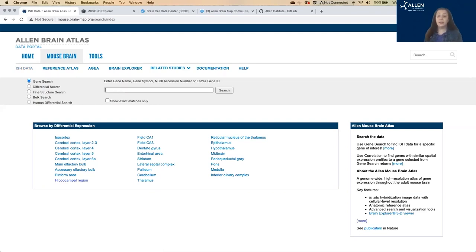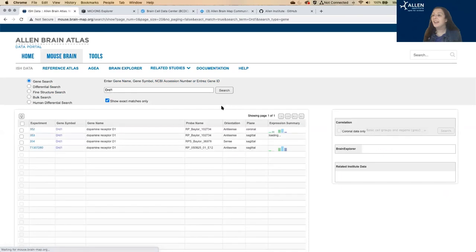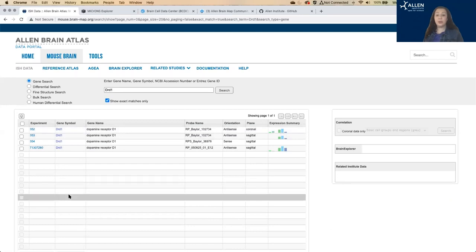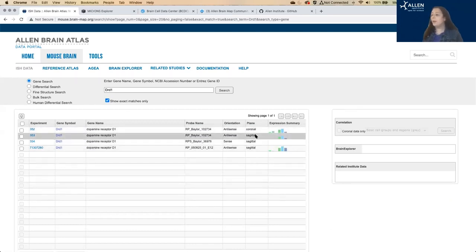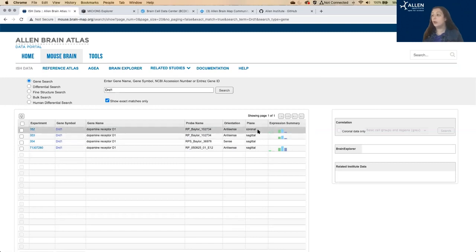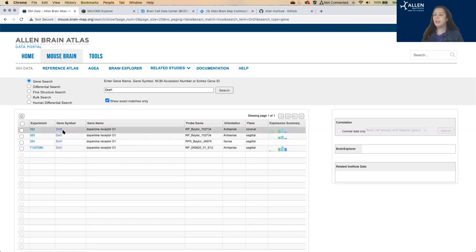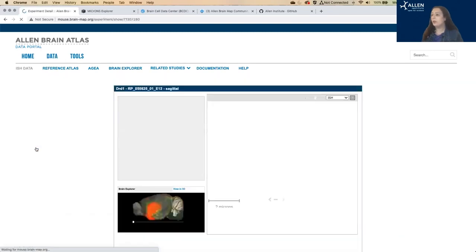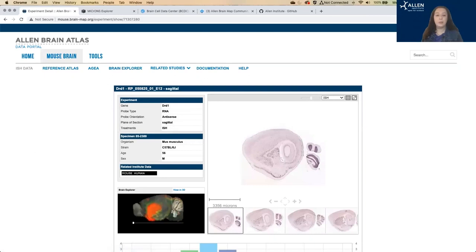And alternatively, you can search by a single gene. So I'm going to pick a random gene. And then you can pull up these experiments that show that gene's expression. We have a few different parameters here, so you'll notice we have three sagittal experiments and one coronal. We have different orientations of the ISH probes, sense versus antisense. I'm just going to pick one of the sagittal experiments to show you that expression in more detail.